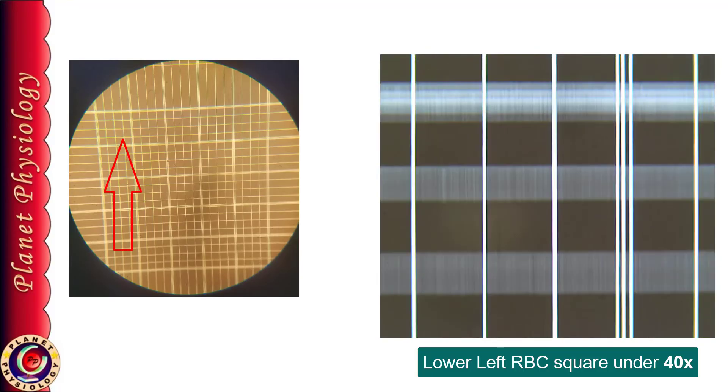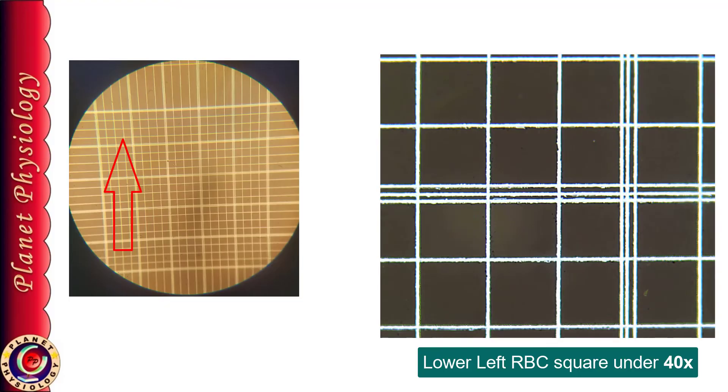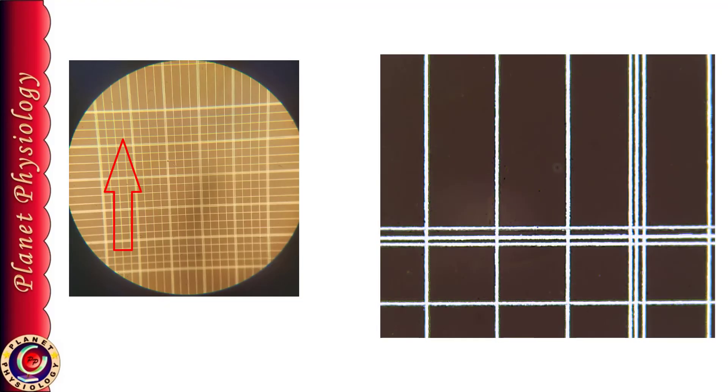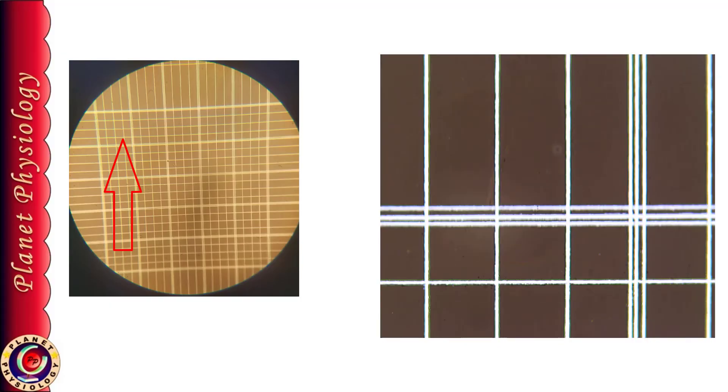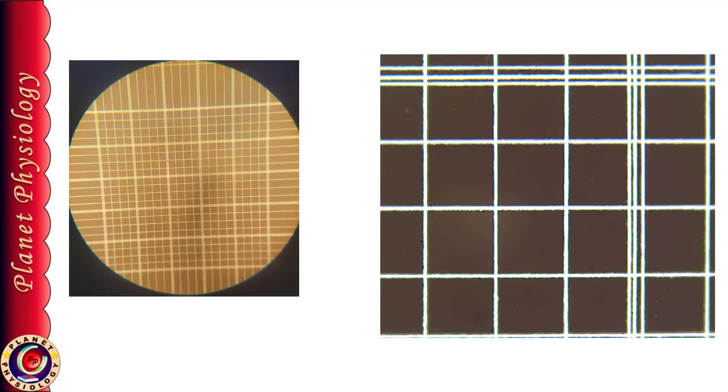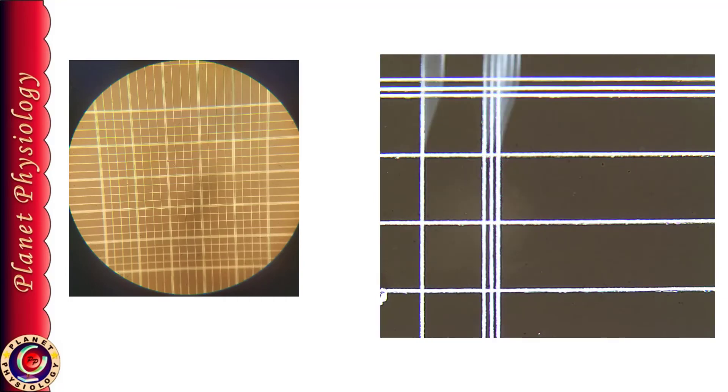1st square, entering the 2nd square, entering the 3rd square, 4th square and now 5th square. You can note that again on upwards now only there are vertical lines. So this is how you can confirm your squares.